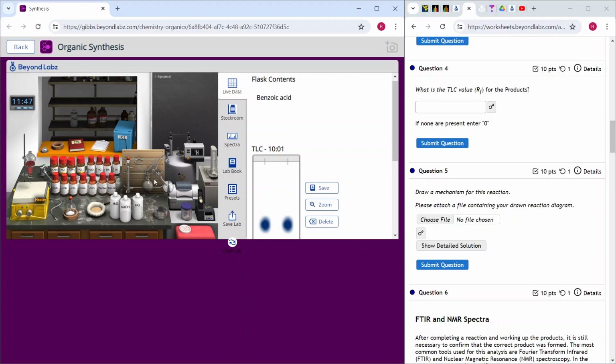So all you need to do is go ahead and bring that distillation all the way into this station and bring your flask into the distillation setup there and turn on the heat and monitor the temperature of the reaction, because one of the components will evaporate at a lower temperature, and whatever evaporates at a lower temperature, that needs to be your product that you would need to isolate. Okay, in there. So here you go.